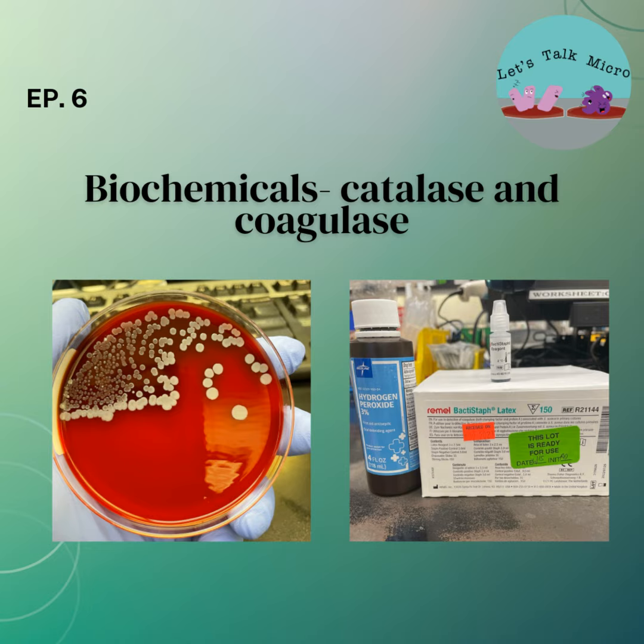So I hope you enjoyed the last one. Finally, we talked about all the objectives on the microscope. We went over 100x, we went over 10x, and on the last episode we talked about 40x, right? The high dry objective, very useful in urinalysis, and very useful for motility. And I went over the wet mount, a very simple procedure where you add saline. Some books say add water. And then you add your colony, put a cover slip, and look at it under the microscope. Very helpful tool for motility.